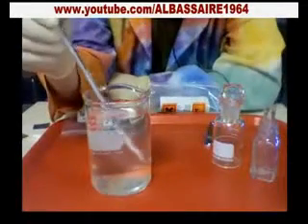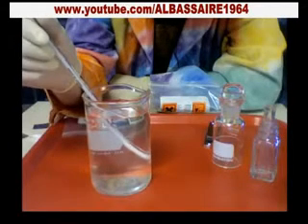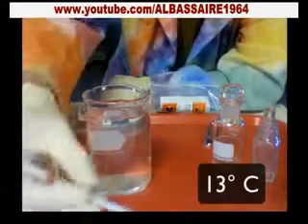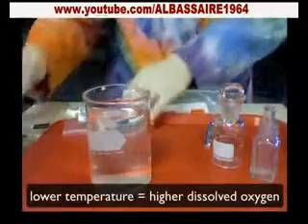This is water that I grabbed from the creek right outside. It's kind of cold because it's springtime, and this looks like it's around 13 degrees Celsius, which is something like 55 degrees Fahrenheit. So temperature is one thing that can affect dissolved oxygen. Next, I'm going to clear some of this stuff out of the way.